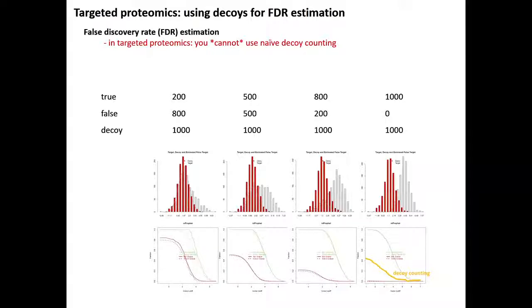Can I follow up? Have you tried more sophisticated models than LDA? The original mProphet was done for MRM data. That's why it's called mProphet, for MRM Prophet. It was originally trained on MRM chromatograms. There was no MS2 dimension score. So this is something that we stretched to DIA originally. We did try other ways to combine these scores when I was also involved in the PeakView developments, the very early versions of PeakView from SCIEX. But I think at the end we also switched back to LDA. I don't know, I think we were not refining.